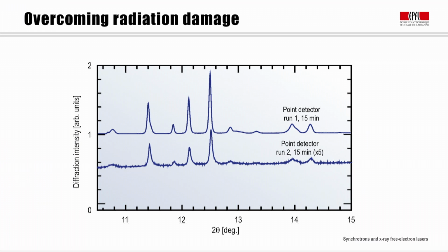This was strongly indicative of radiation damage, a common problem with organic based matter, with their, on average, relatively weak bond strengths.